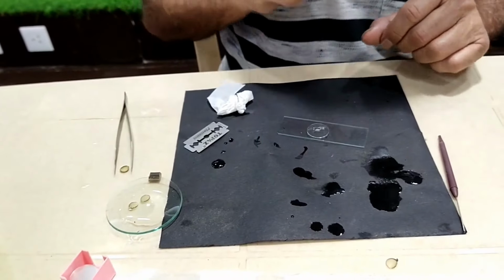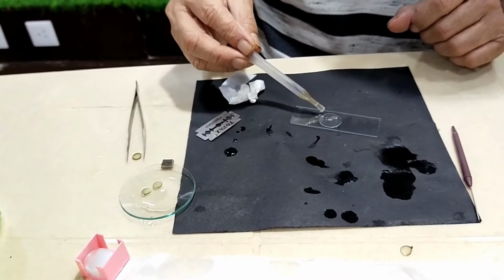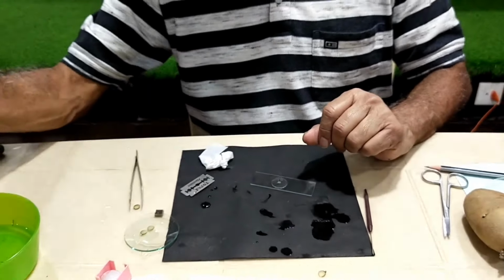and there's a small gap left, and I'll fill it up with water. I think that is done. I think I can adjust this slide now under the microscope as usual.